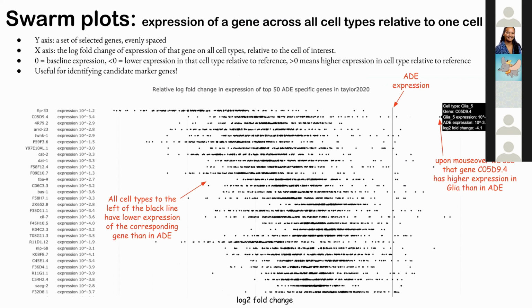And the way that this plot works, the data that it's being displayed here is the following. You have a selection of genes here on the left. You show the expression level or the expression rate that is inferred by SCVI, because usually you want marker genes to have high expression.